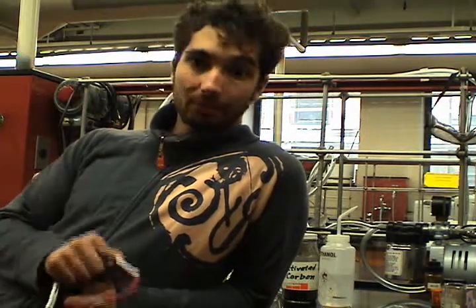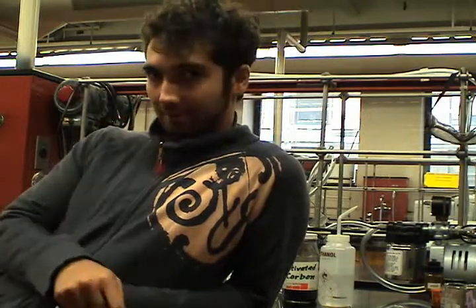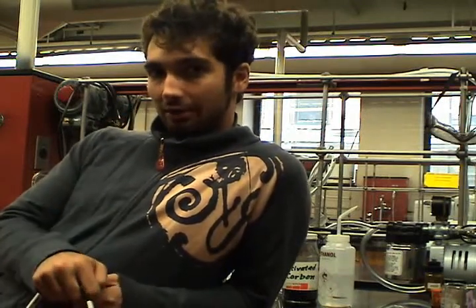Hi, Justin here. You might remember me from such films as The Melting Point Apparatus and You. Today, I will be telling you about hot gravity filtration.